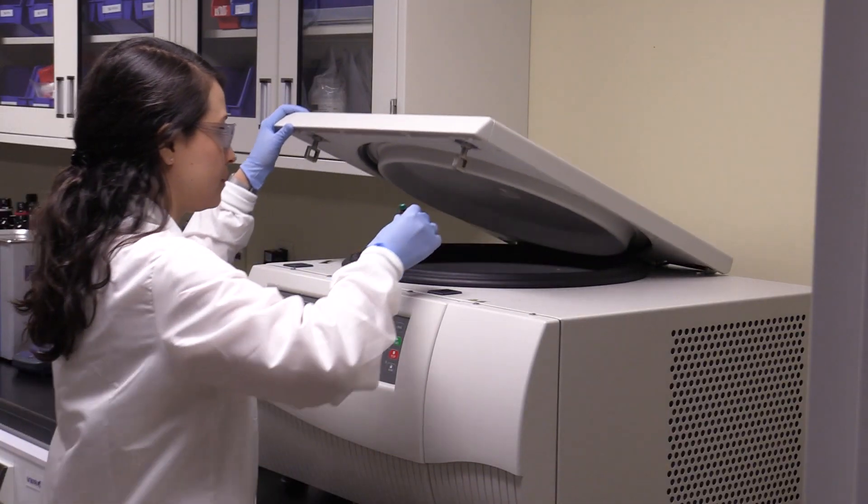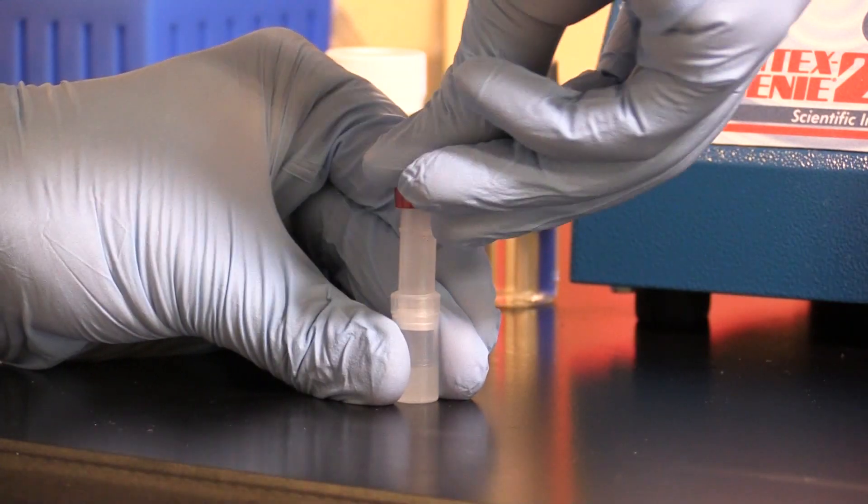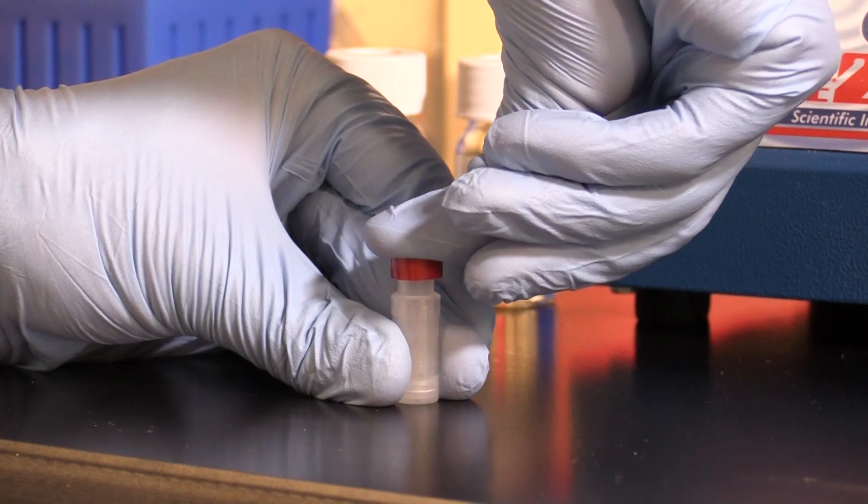For many labs out there who are running a lot of complex samples with dirty matrices, consider centrifuging and filtering your sample using syringe filters or filter vials prior to analysis.